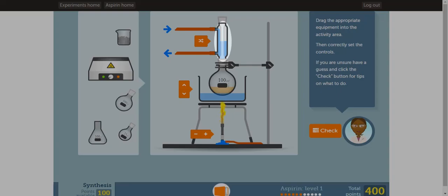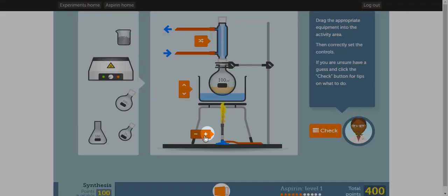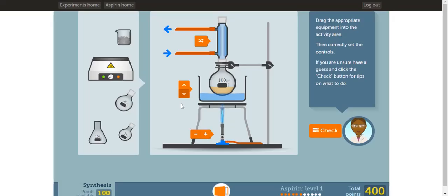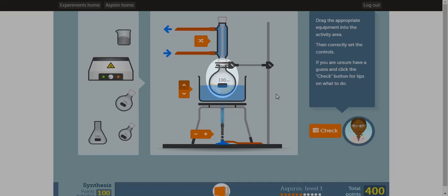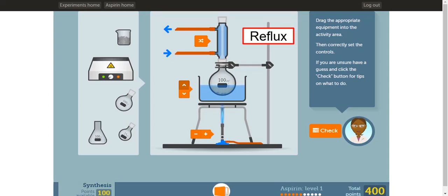The liquid flows back down into the round bottom flask. Notice that the condenser is not completely filled with cold water. To fix that, you must have the water flow from bottom to top rather than top to bottom. So click this button to reverse the water flow. Next, you want to change the Bunsen burner flame to blue, because blue flame is hotter than yellow flame. Click the plus button. Next, you want to raise the water level so it covers more of the round bottom flask. Click the up button to raise the water level. Notice that the round bottom flask is shaking a lot. To avoid this, add the anti-bumping chips. The purpose of the anti-bumping chips is to make sure it boils more calmly. This setup and lab technique is known as a reflux.